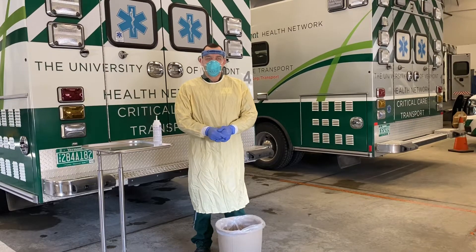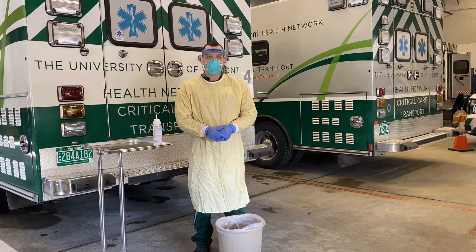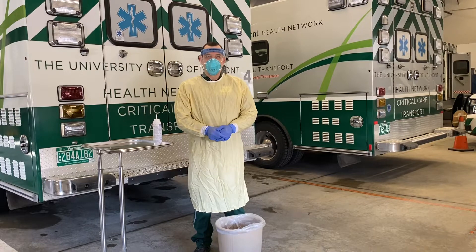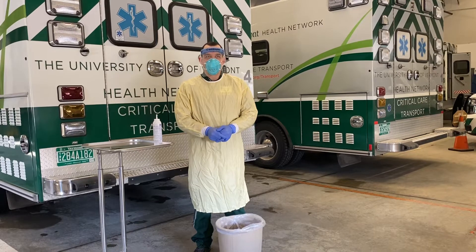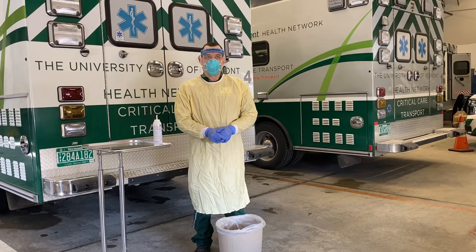Welcome. This is a brief tutorial on doffing personal protective equipment presented by the University of Vermont Medical Center Health Network. The following is the CDC's latest recommendation for doffing PPE. You will be removing all PPE before exiting the patient's room except for your N95 mask. You will remove your N95 mask after leaving the patient's room and closing the door.